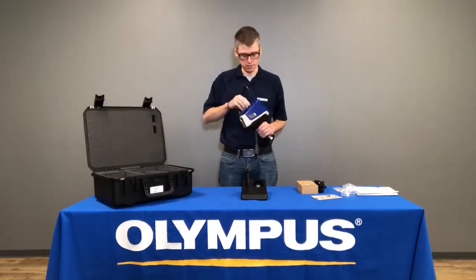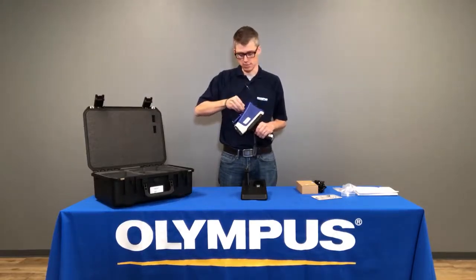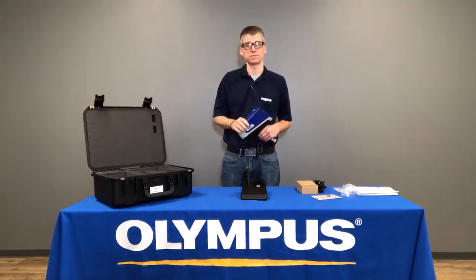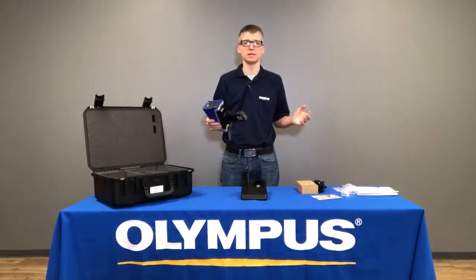The USB stick can also be used for USB data management. You can place that low-profile USB stick in the top of the instrument and export results directly to the USB or as PDF reports. From there, you're ready to get started testing.